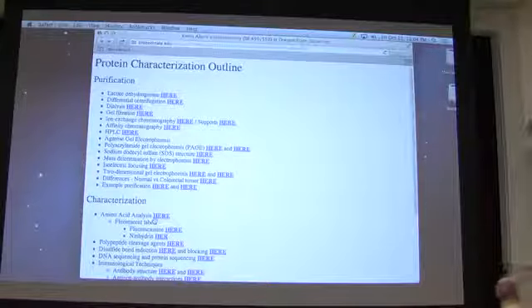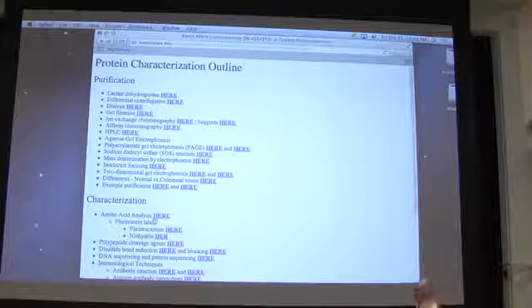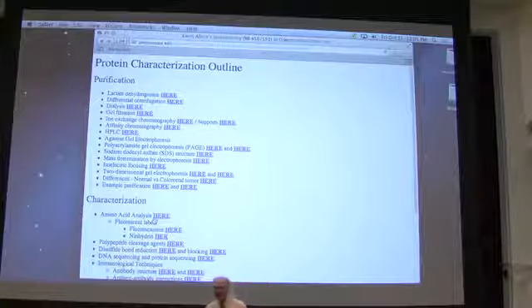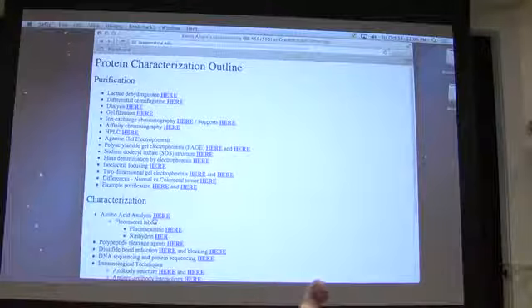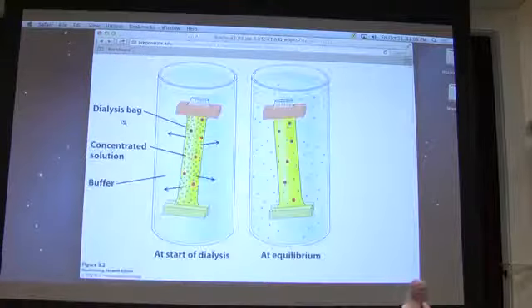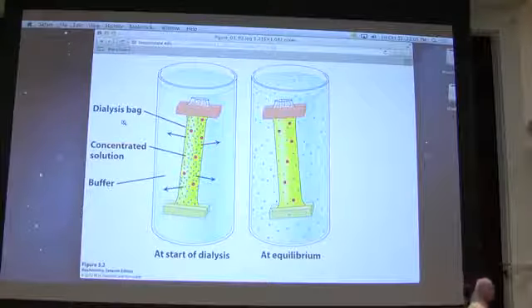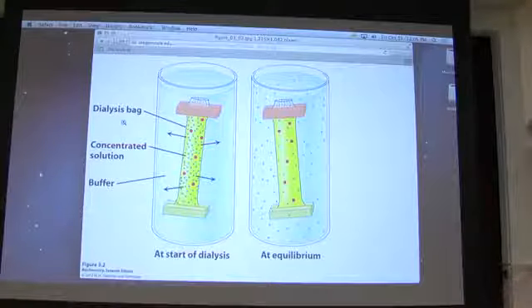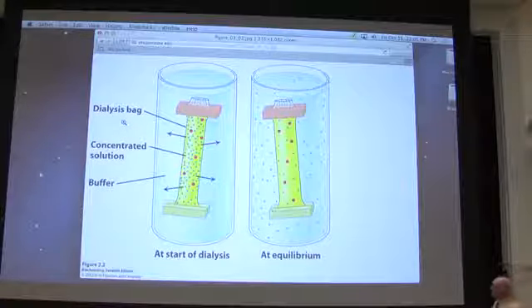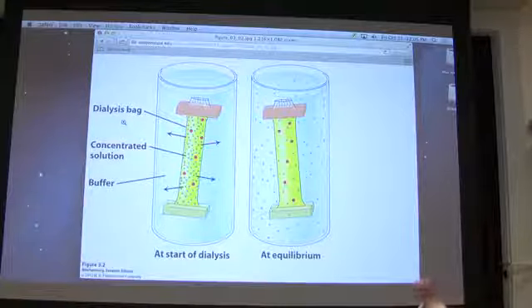Okay? So one of the very common techniques that we work with, and particularly it works very well with proteins, for example, and one that you probably did in basic biology or maybe even chemistry, was to use a technique called dialysis. Now, dialysis is a way of separating small things from big things, and the basis by which it works is it involves taking your soup.